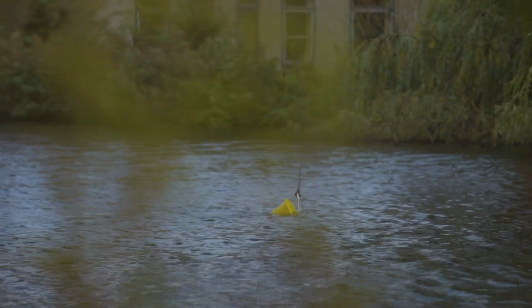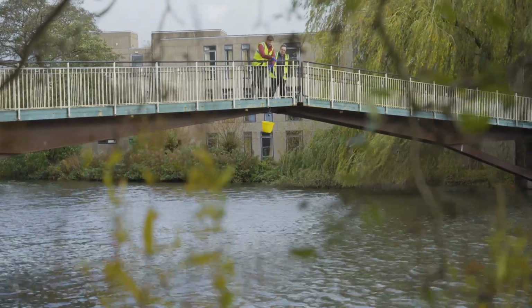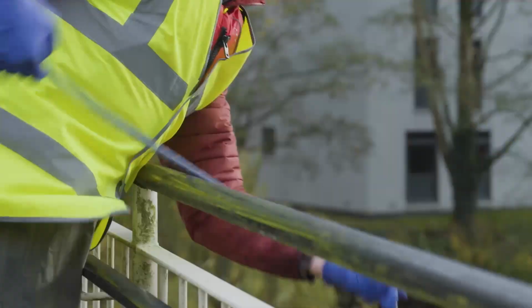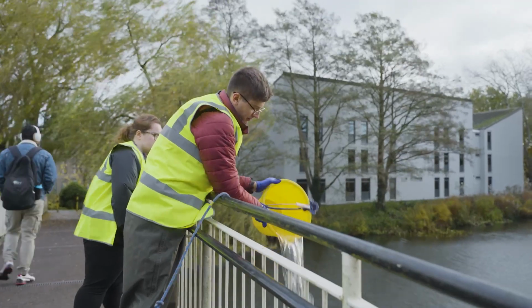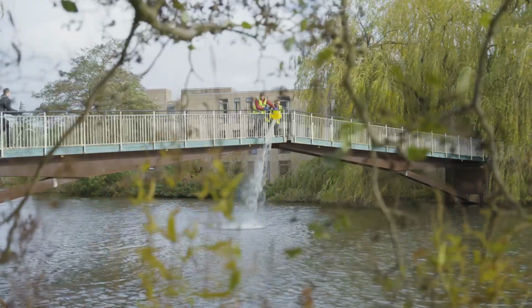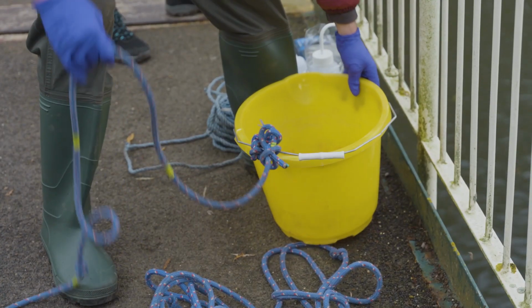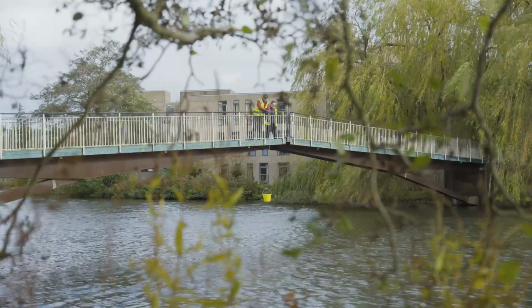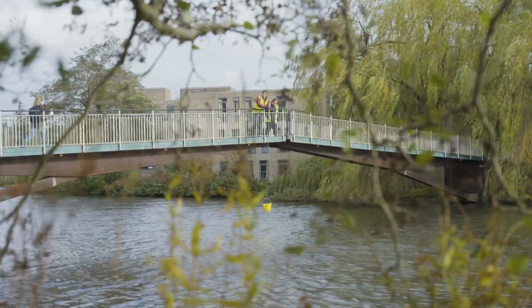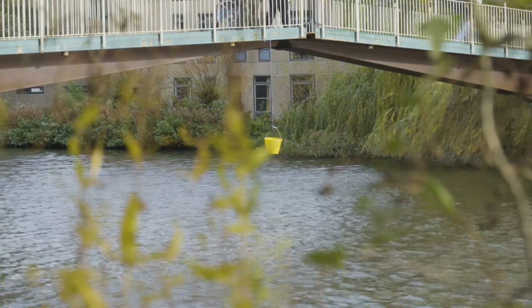Using a bucket for collecting samples is ideal for scenarios where you can access the middle of the water body via a bridge or boat. This ensures your sample is more representative of the wider water body and can reduce disturbance of the sediment, which may contaminate your sample. Make sure your bucket is tightly tied to your rope, then slowly lower over the side of the bridge or boat until it's under the water surface. Once the bucket is full, slowly pull up and collect your sample.